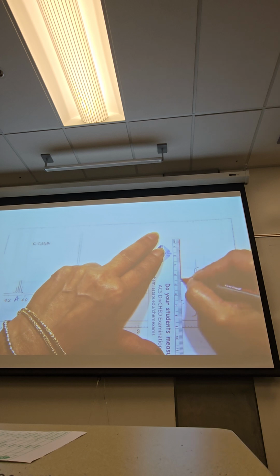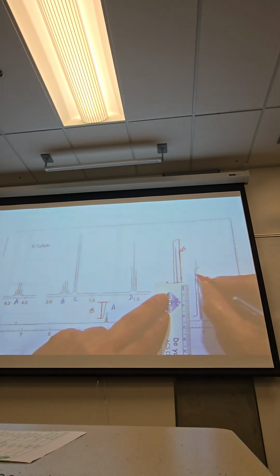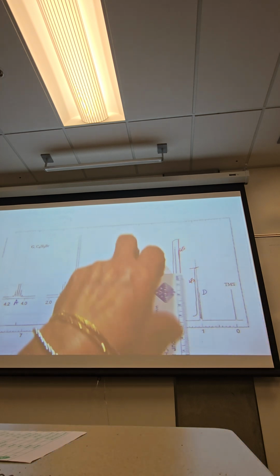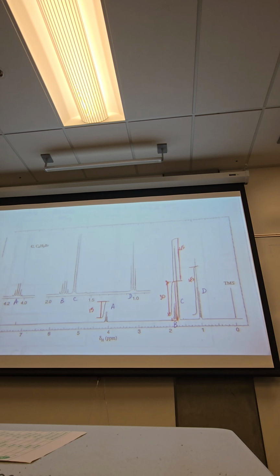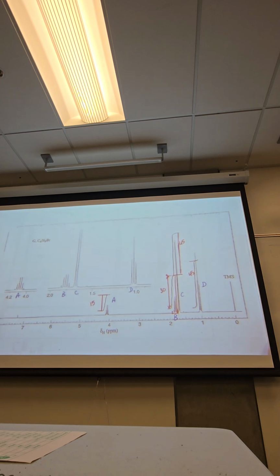Excuse me, 45 millimeters, not centimeters. And from the start of the integration curve to the end, it's 45. You're also saying millimeters, not meters or liters. Okay, millimeters, yes.